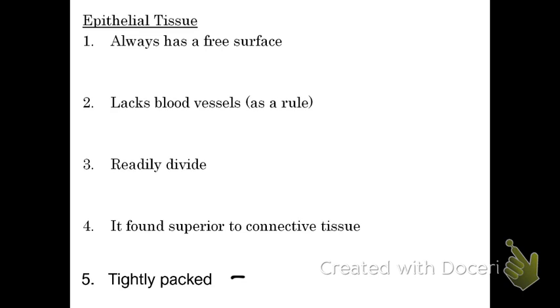That means that there's very little extracellular matrix. Very little ECM. Very little stuff outside of the cells because the cells are all touching each other and are tightly packed together.